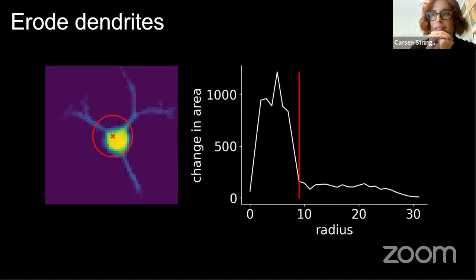We haven't had much success tailoring it cell by cell. A lot of the fitting procedures that we've tried seem to fail, particularly in low SNR cases. But yeah, it can be a problem. If you're really worried your cell is out of plane, you might really need a higher neuropil coefficient. But if your cells end up being relatively uncorrelated to each other, like we might expect in cortex, then you can hope that your neuropil correction was decent, if that helps.